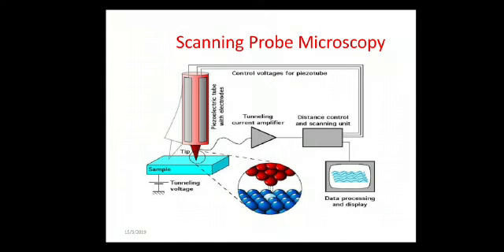The two primary modes are, first, contact mode, and next, tapping mode. Under contact mode, the force between the tip and the surface is kept constant. This allows a scientist to quickly image a surface. In tapping mode, the cantilever oscillates, intermittently touching the surface. Tapping mode is especially useful when the scientist is imaging a soft surface.